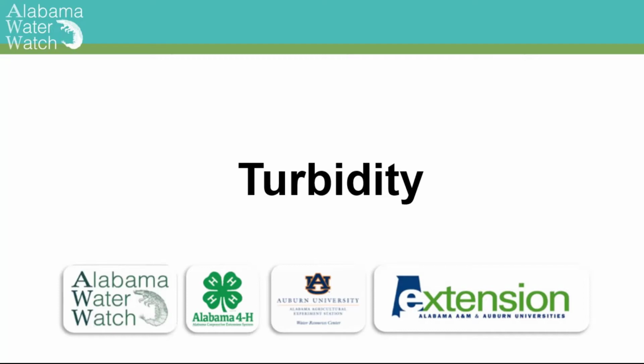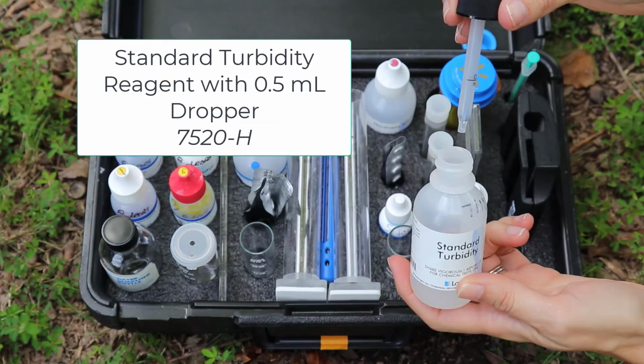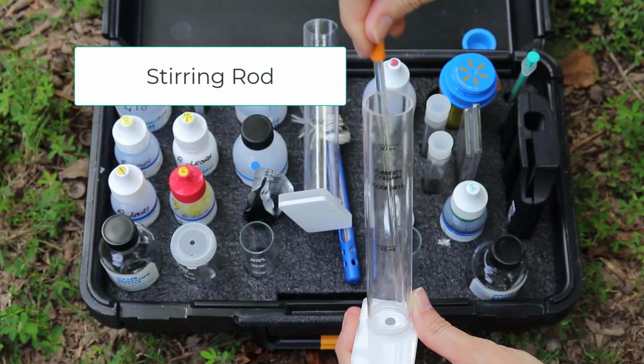Turbidity. This video will show the proper method for collecting water samples and conducting a test to determine the turbidity of a water body. For this test, you will need two turbidity columns, code 0835, standard turbidity reagent, code 7520-H, and a stirring rod.